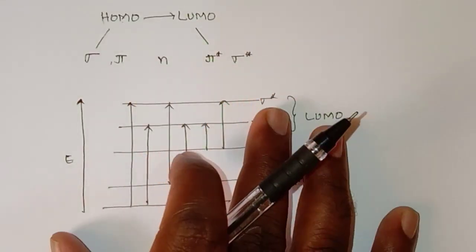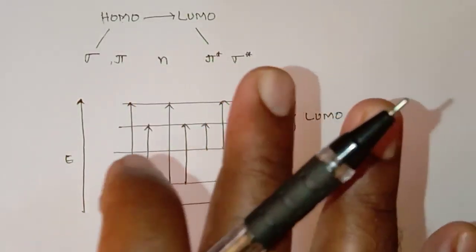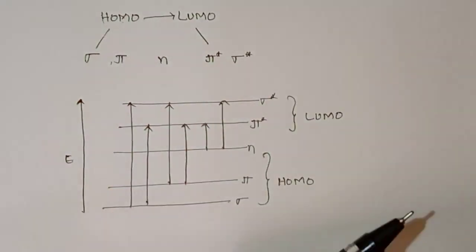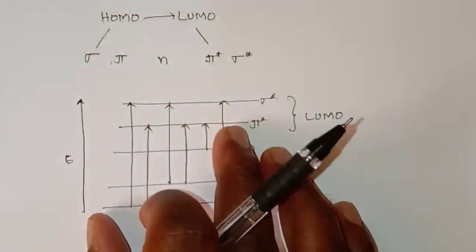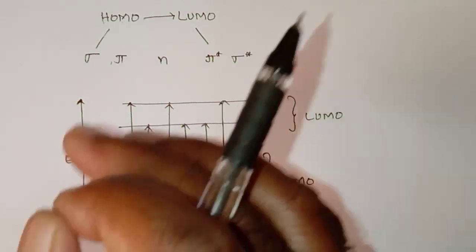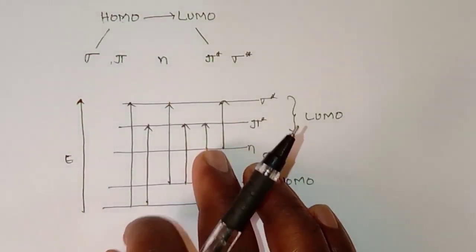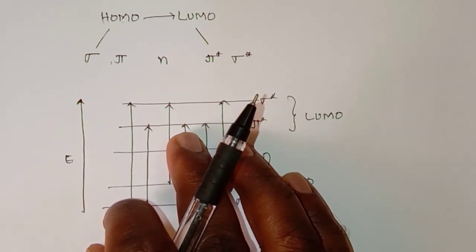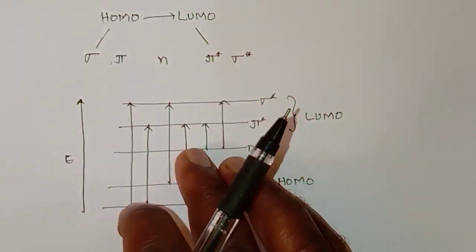By knowing that only, it is possible to exhibit the complete graph, the complete spectrum for a molecule. Based on that, it is possible to say about the structural details of a material. And now we shall see which are the allowed transitions and which are the disallowed transitions.